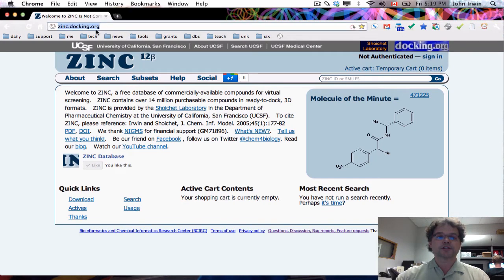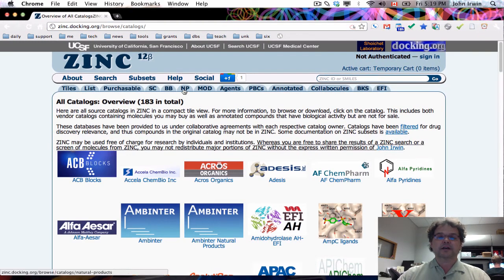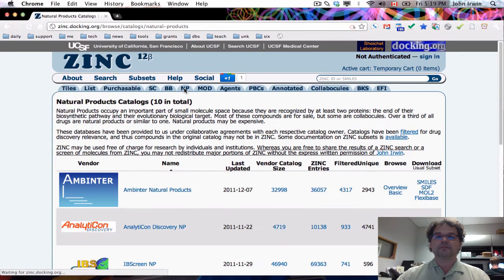So this is the ZINC interface, zinc.docking.org. And if you go to Subsets, Catalog, you'll find a tab. This is all the catalogs that are in ZINC, but we're interested in the natural products. So we're going to click on NP for natural products. If you hover your mouse over there, it'll say Natural Products.